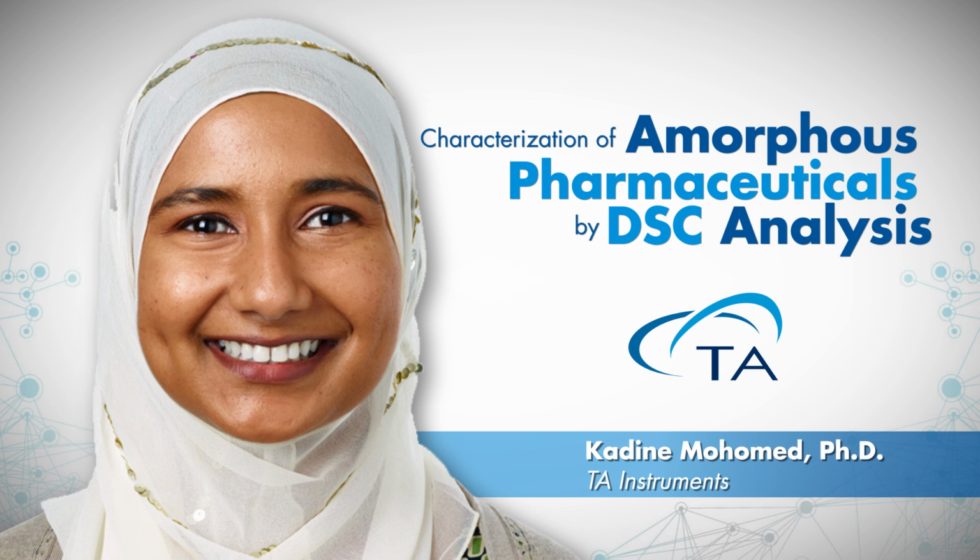So the question is, what is the optimal heating rate? The plasticizer, in addition to shifting the glass transition to a lower value, can certainly broaden the Tg over a wide temperature range. And with that broadening of the Tg, it may be difficult to really find that deviation from the heat capacity baseline, the step change of the glass transition followed by the heat capacity baseline of the sample after the Tg. So we can try to increase the heating rate to maximize the step change associated with the Tg.